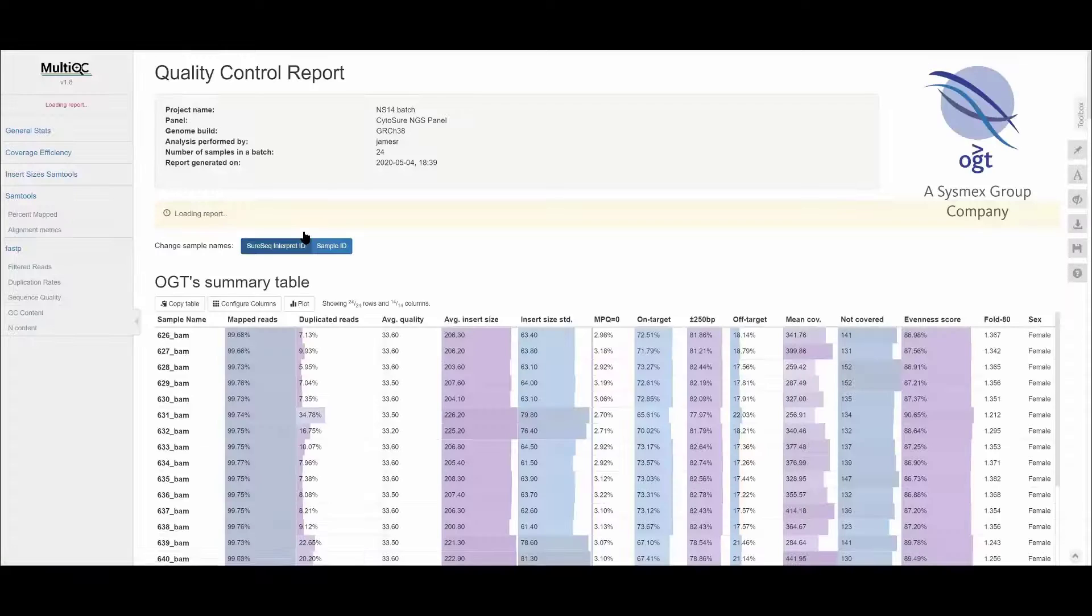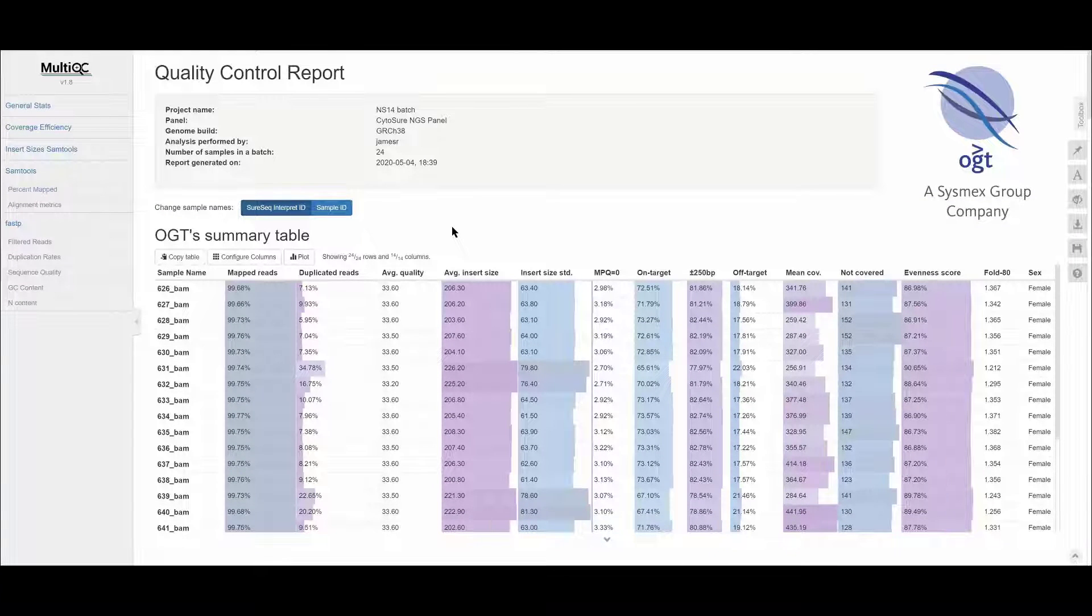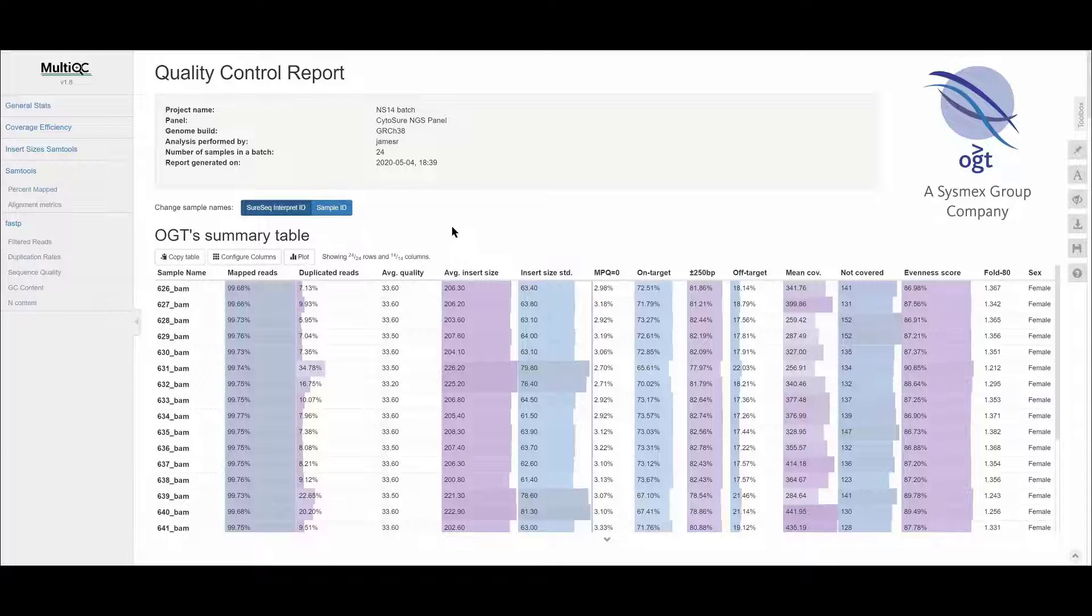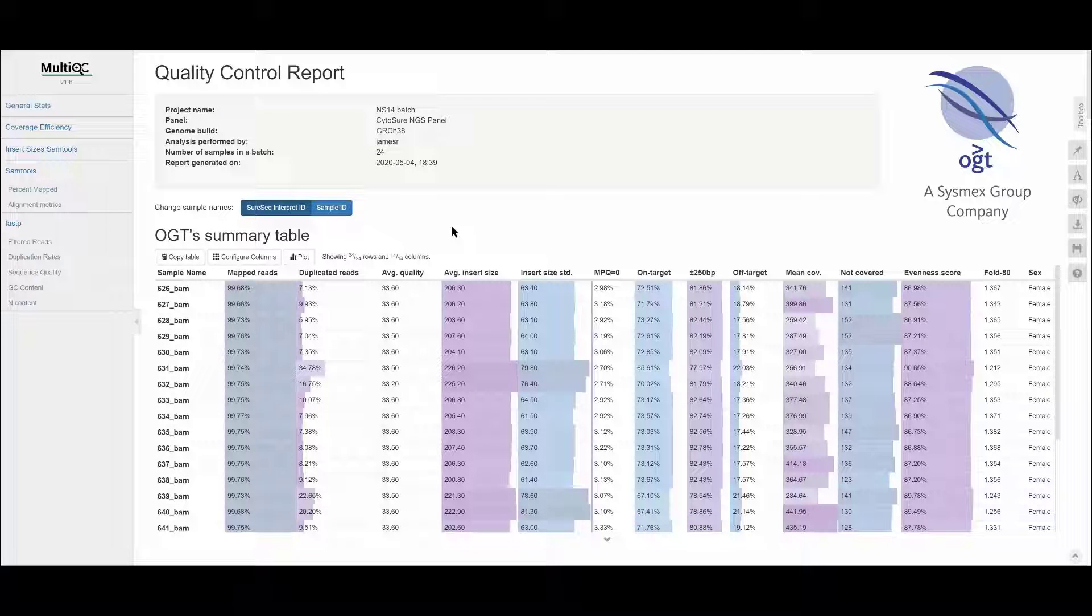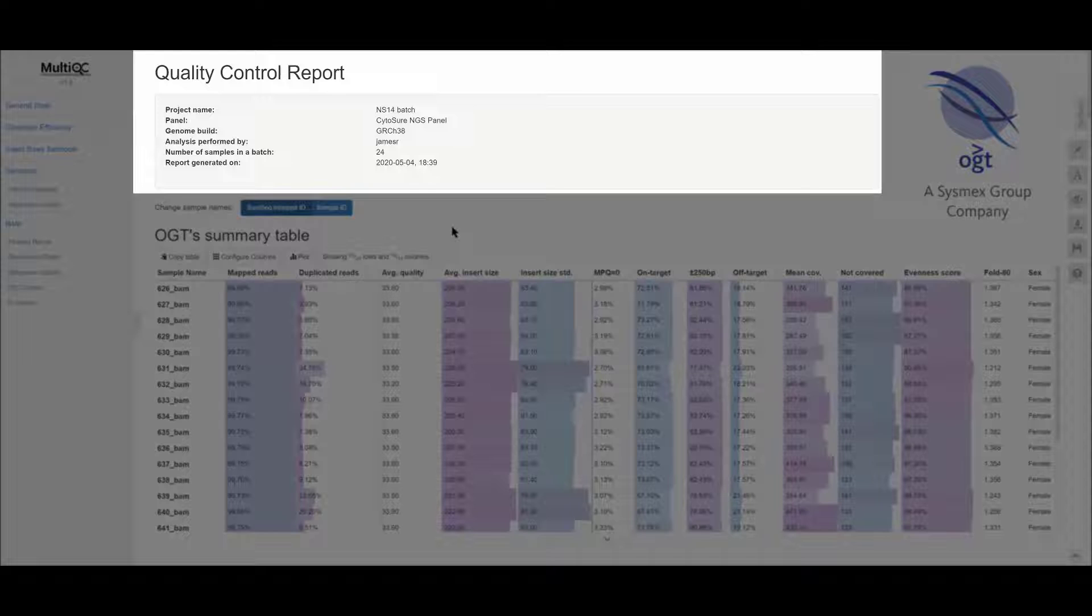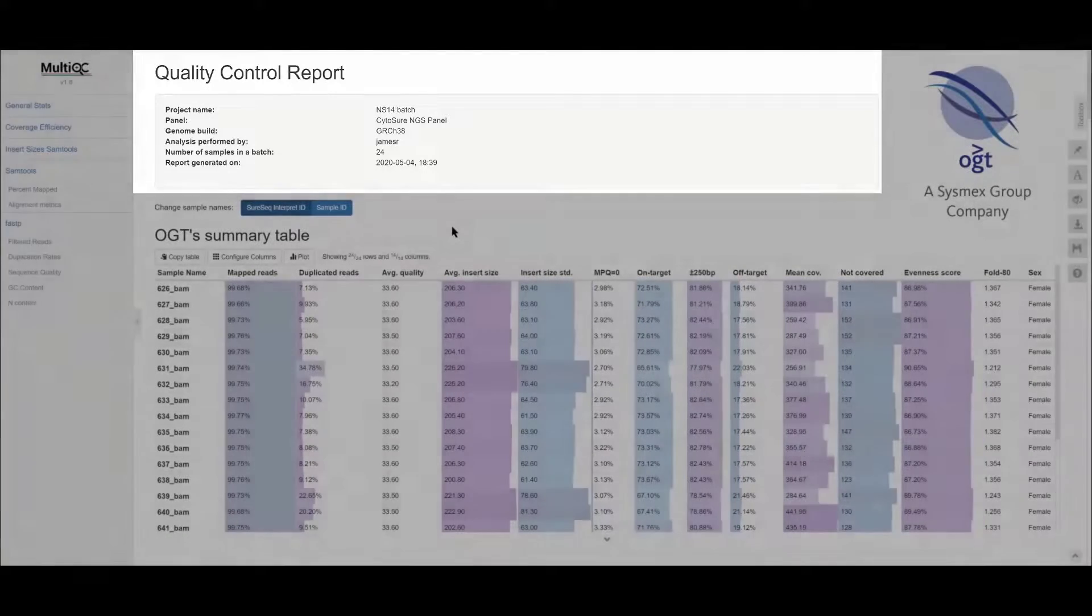This tool scans the sequencing results files generated from the analysis pipeline. The relevant information is then brought together to generate a single standalone HTML report file for all the samples in the batch. At the top there is a header which gives the batch information.